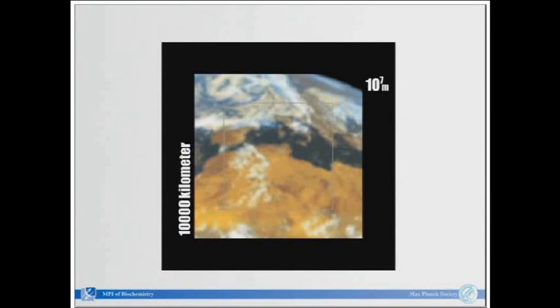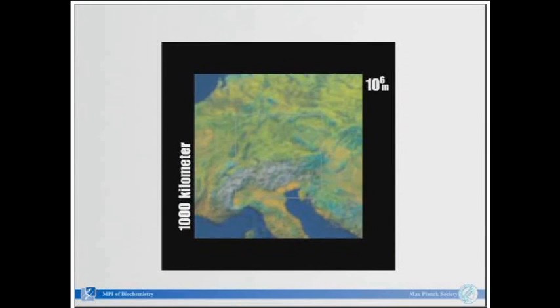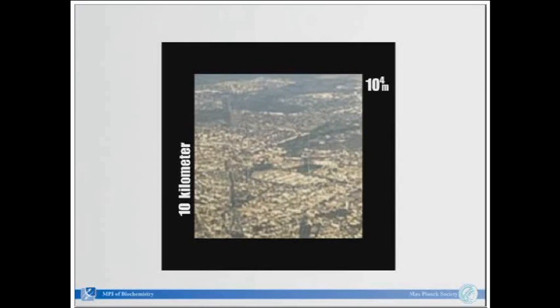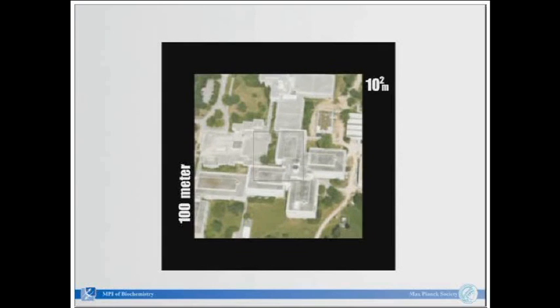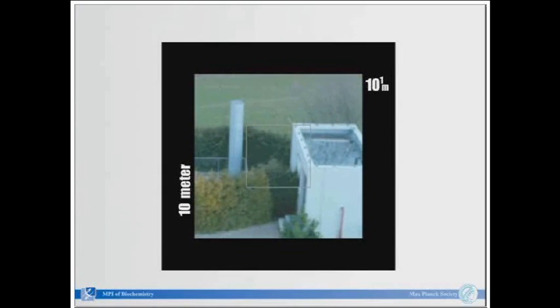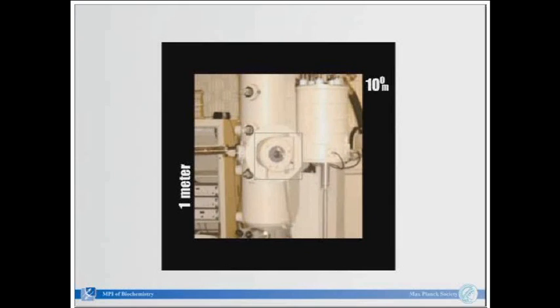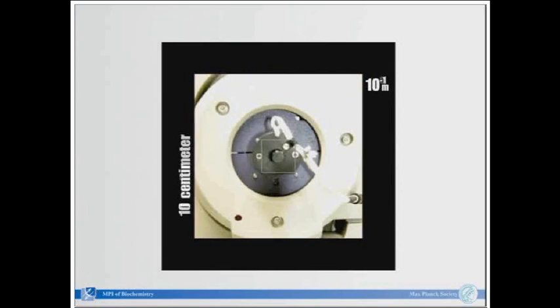So that's my teaser movie. It's adapted from The Power of 10, which is very well known in Europe, but not so well known in the States. So we can also say Google Earth. You're approaching from a large scale, from 10 to the power of 7, to a very small scale, 10 to the power of -7. So you miss our department here, and we go to that building, which is the entrance to the bunker. When we did that movie, we featured the Polara microscope, but there you can see that it's actually a microscope. It's not only a box.